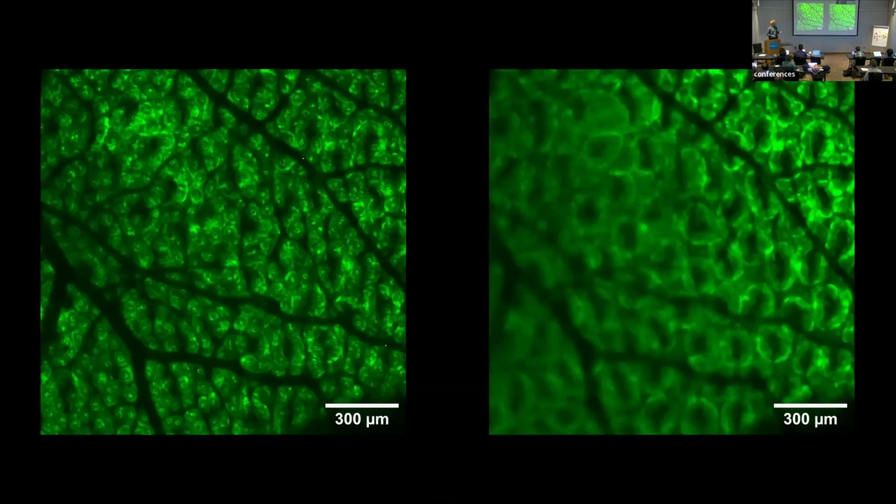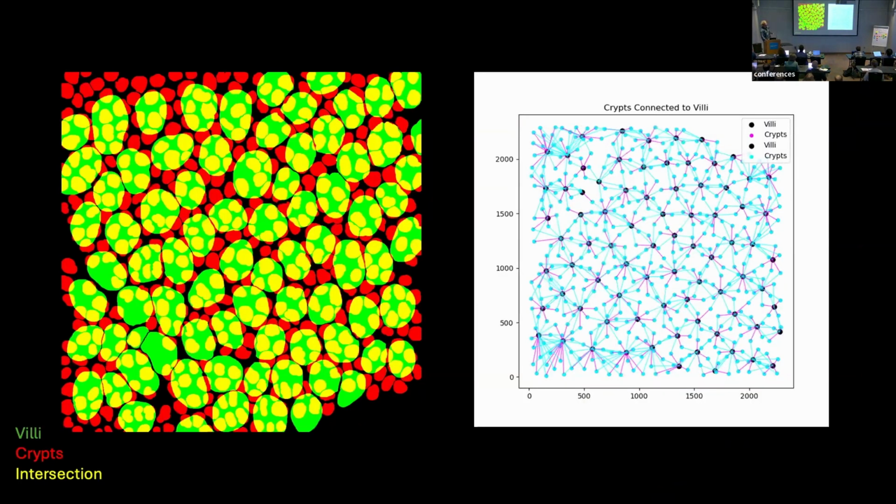I noticed with lower magnification that I look at not only crypts, but also slices of villi in living tissue, which is extremely cool. So looking differently, you can look at 3D architecture of how crypts and villi are organized. And I've calculated plenty of symmetry and stuff.